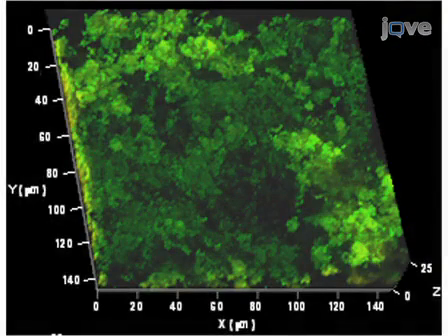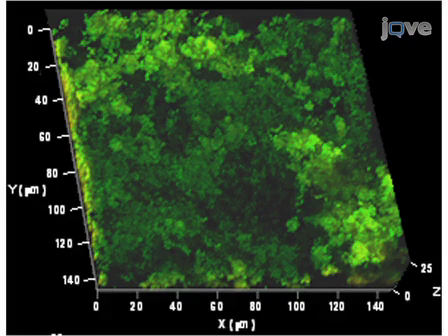This image is a three-dimensional reconstruction of Z-stack images of a live/dead stained H. influenzae biofilm collected using a confocal microscope. The biofilm shown here is an example of a biofilm formed by NTHI after 24 hours of growth in the chamber slide using this technique. The bacteria were viable at the time of fixation, as indicated by the green fluorescence and the absence of red fluorescence. The architecture of the biofilm can be seen quite clearly, with numerous towers within the biofilm structure and many water channels present. The side view in panel B demonstrates the relative height of the biofilm formed at this time point.